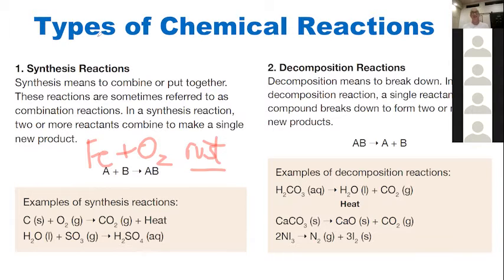So basically, that's a rapid reaction, not as rapid as when we actually burn it a little later on. That's even more rapid. But yeah, so that means it's an endothermic or an exothermic reaction. Exo. Exothermic, exactly. Excellent. So that's a synthesis: you take two separate things, you bring them together and you make a new thing. And a decomposition is exactly the opposite. You take a thing and you break it down into two different things.